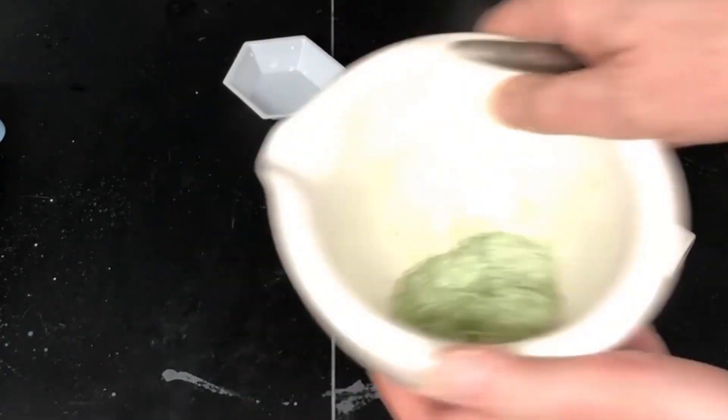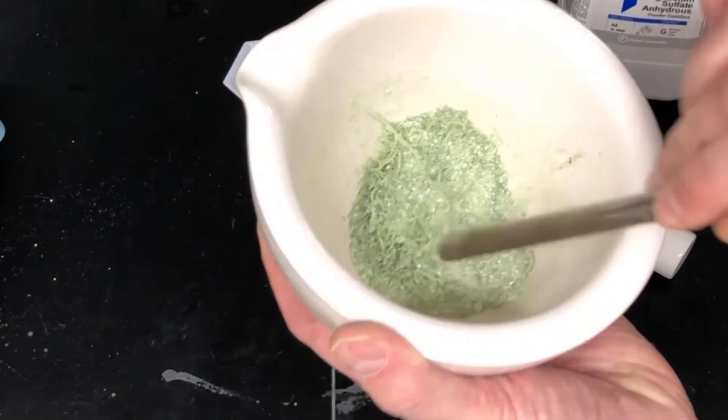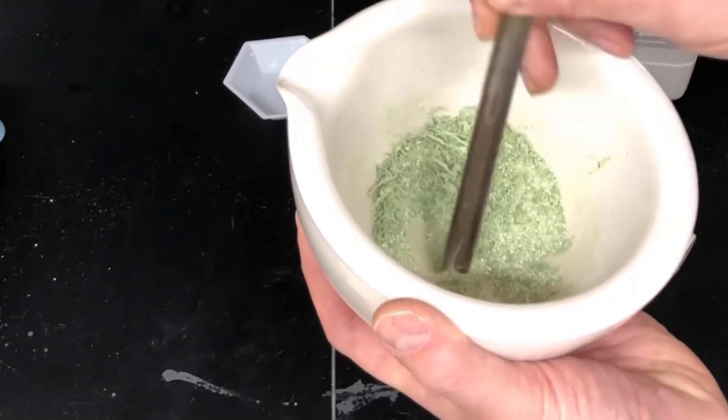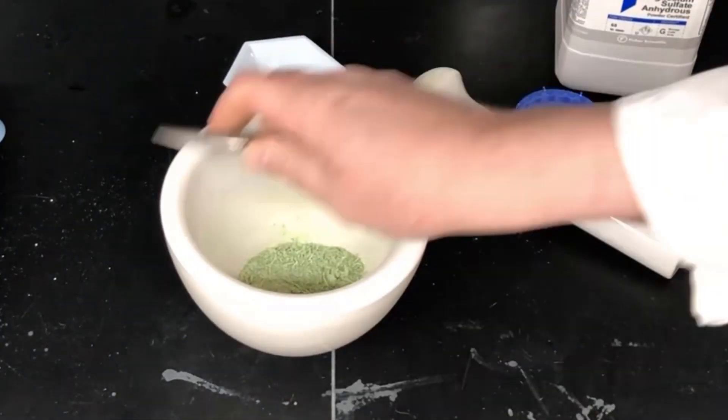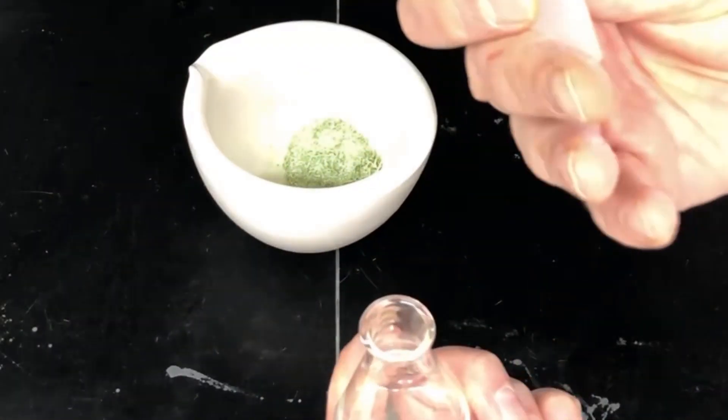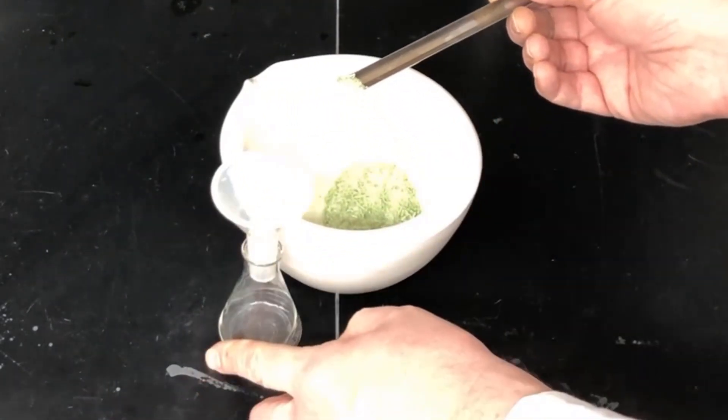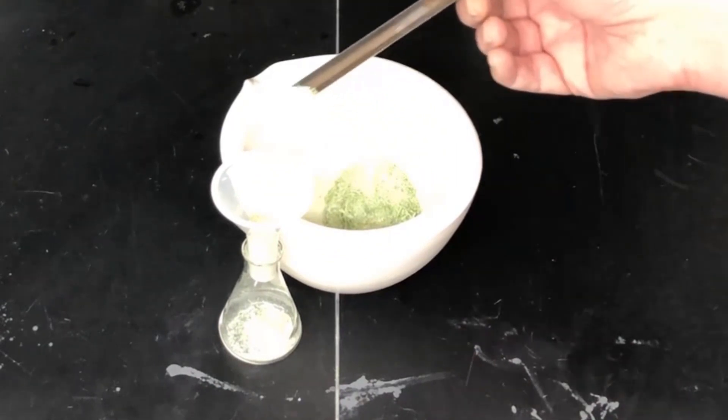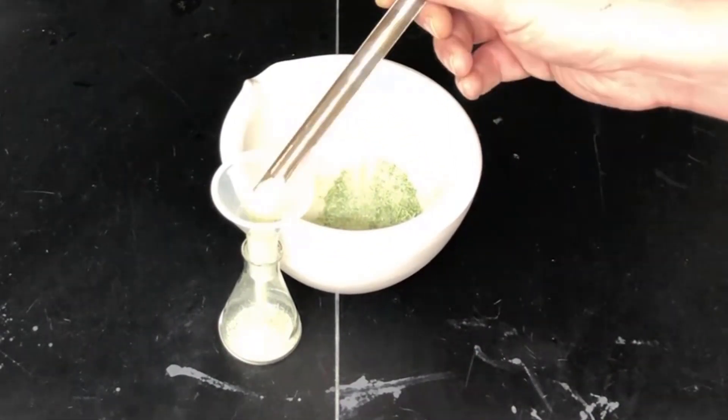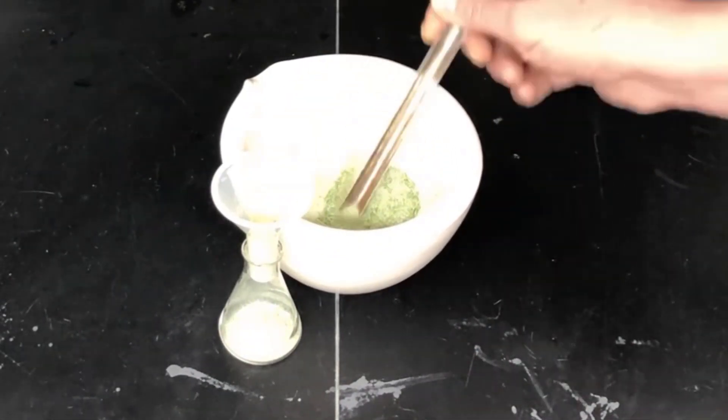And then we're going to move this stuff and put it into an Erlenmeyer flask to extract it. So there's our Erlenmeyer flask. There's a powder funnel that we're going to put on there that's going to help us get the powder into the Erlenmeyer flask. And you can do this however you like. I'm using a spatula to move most of it in.